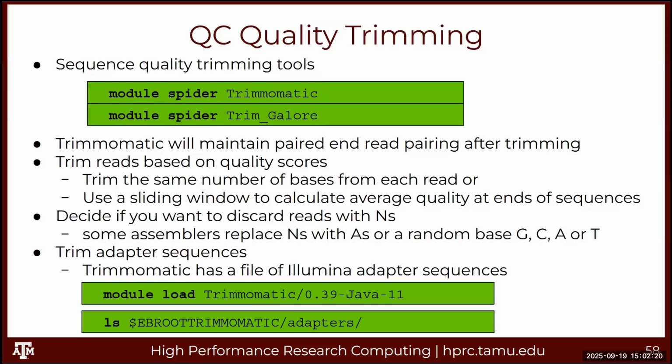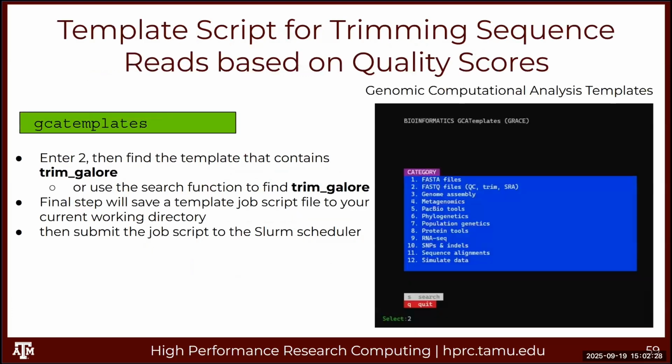All right. Quality trimming. Now we want to trim these reads that we saw. There's a couple of tools, Trimmomatic, Trim Galore. We're just going to go ahead and get into it.